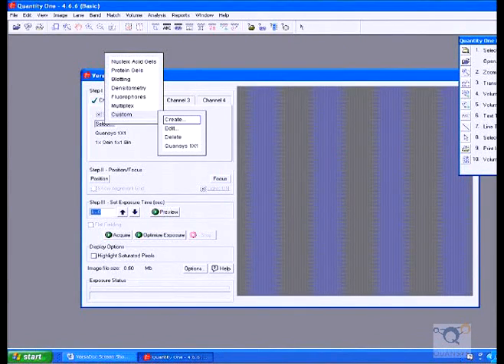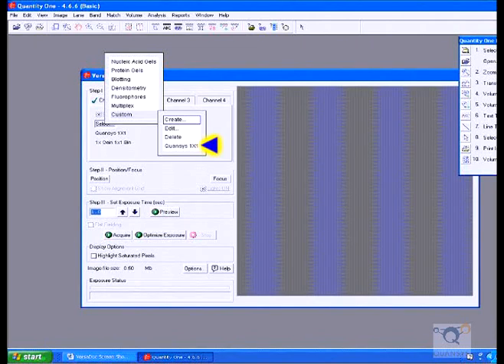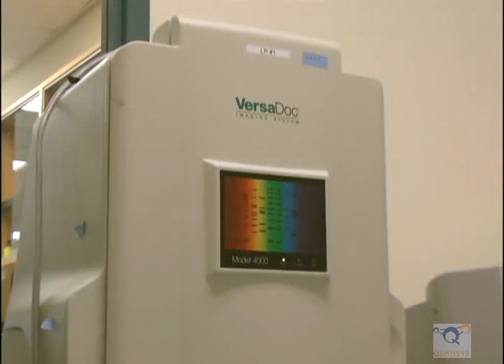Now that this setting is saved, you can use it again for future exposures. Instead of selecting Create, you would select Qwansis 1x1 Binning.